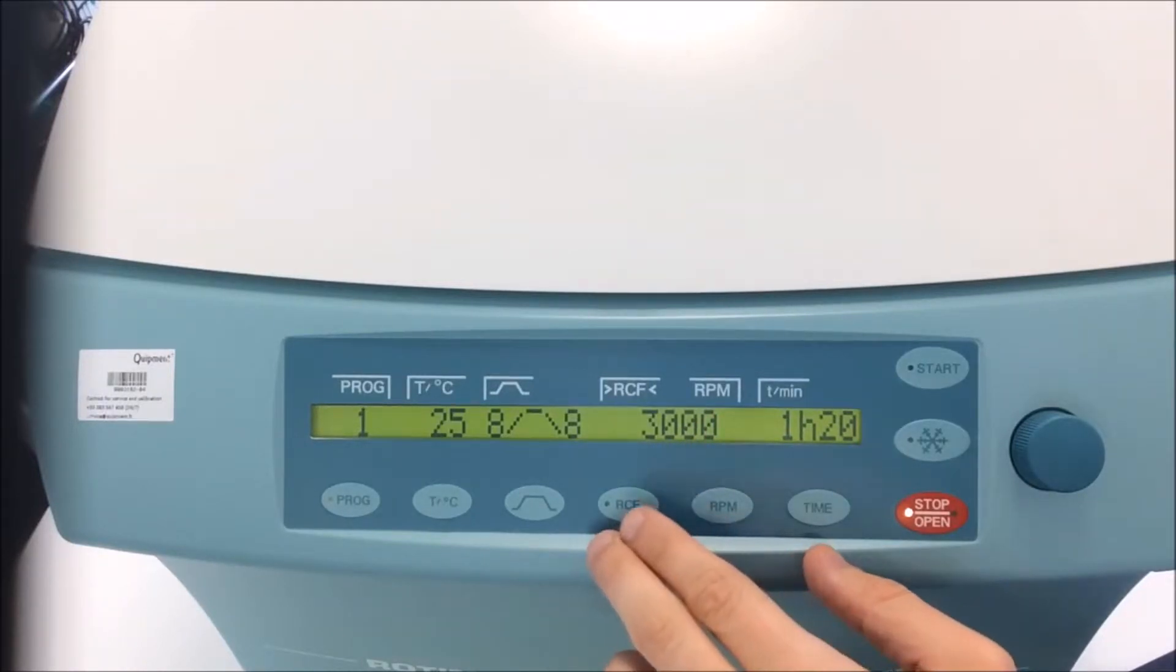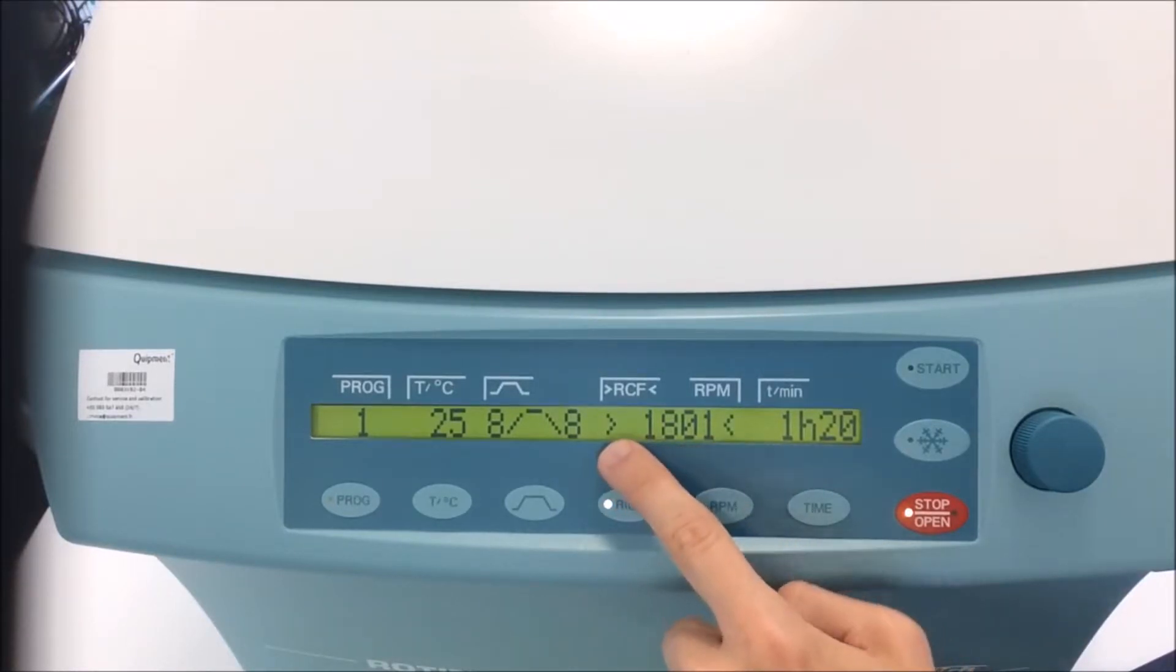It can also be displayed in RCF or GE. I just have to press RCF key. There's a light, and the value is between brackets.